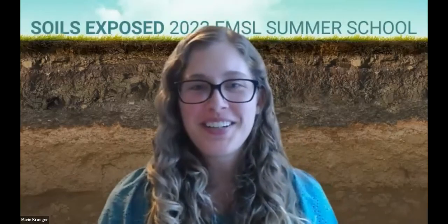Okay, and here's one. This may not be your area of expertise, but do you have an opinion? Which one is better, BONCAT or stable isotope probing for metagenomics analysis of sludge samples? Is Roland on here?